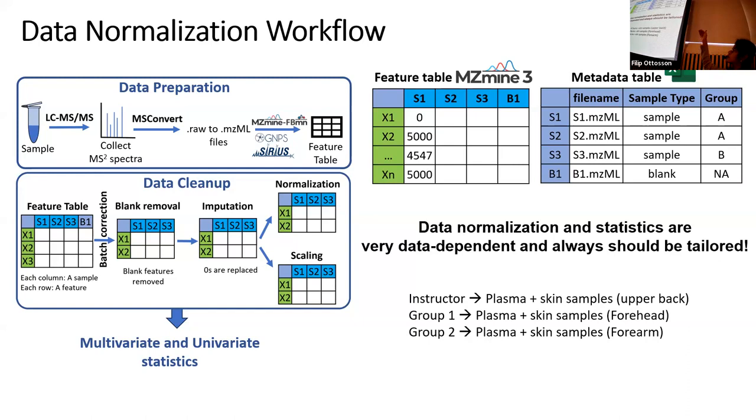So there you have all of your mzML file names as you have in your feature table, and then all the other attributes, which if you want, you could just add. And one more thing I have not added here is that it is also necessary to have a prefix attribute underscore. All this information is also available in GNPS. They have some rich documentation, and you just gotta have this attribute underscore prefix on the attribute columns that you add. So once you've got this feature table and your metadata, then you could perform data cleanup.